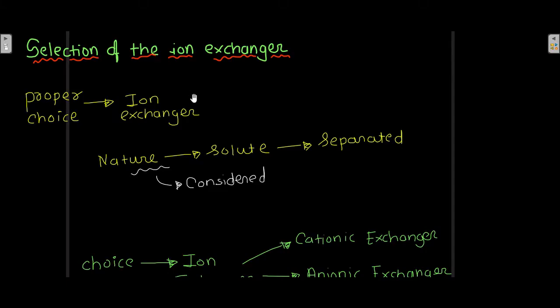Hi. Now in previous videos we discussed ion exchange chromatography. Now in this video we are going to discuss how to select a particular ion exchanger and how to select a particular buffer for an experiment involving ion exchange chromatography. So let's start with the selection of the ion exchanger.